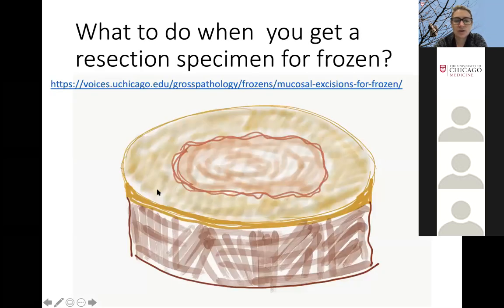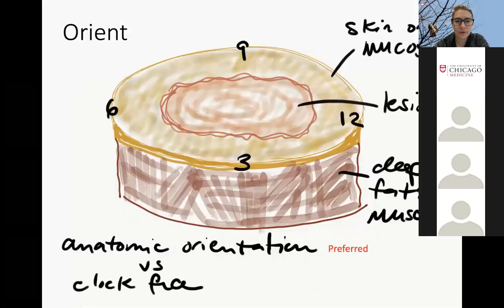All right, questions so far? Nope. All right, so what do we do when we get these specimens? I've already referred you yesterday to the link in my email, to the link in the website, but here it is again. And we're going to go over it in much more detail today, but that's your general overview.